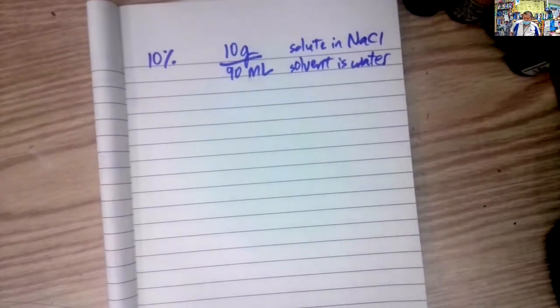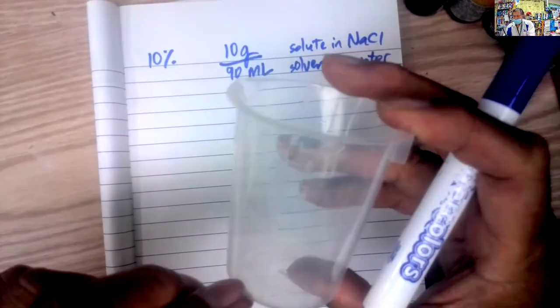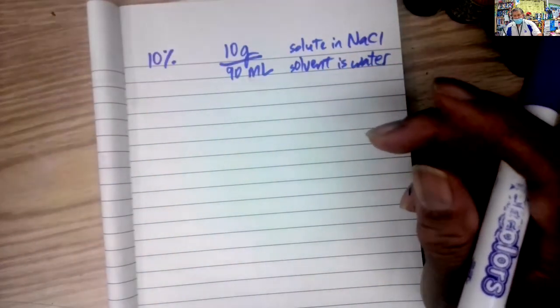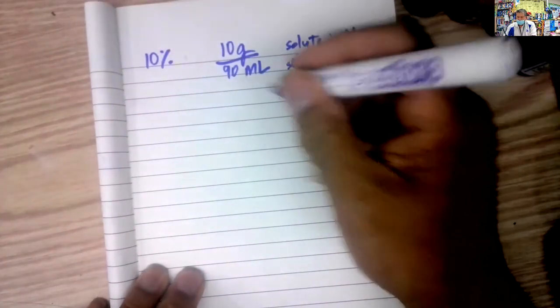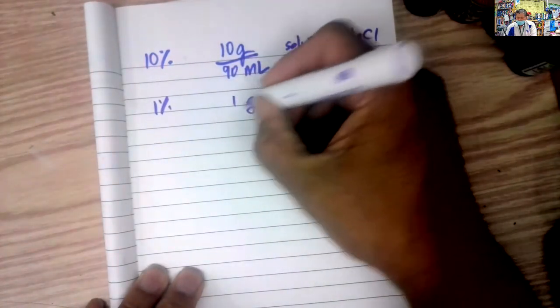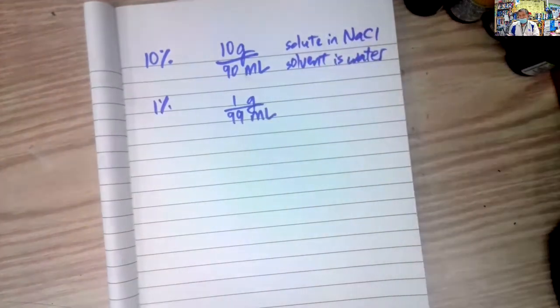It's 10 grams of salt and 90 milliliters of water, but I don't need that much. I just need a little bit to line the bottom of this cup. So I need hardly any. Anyway, that's not a 10% solution, it's a 1% solution. So a 1% solution would be 1 gram in 99 milliliters of water.